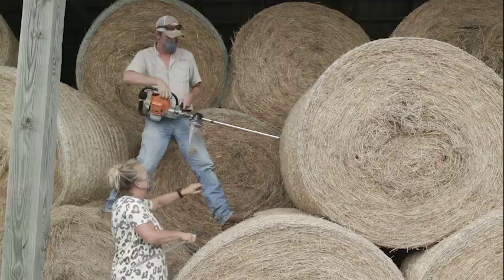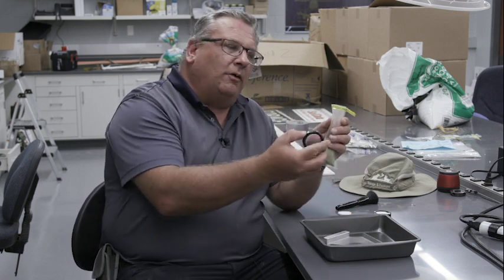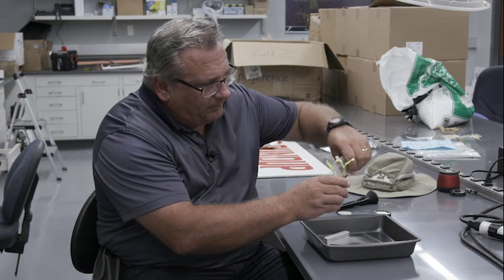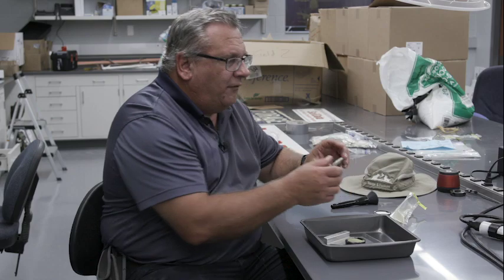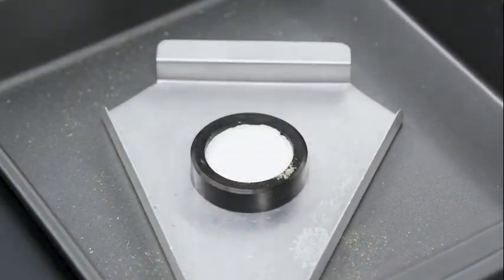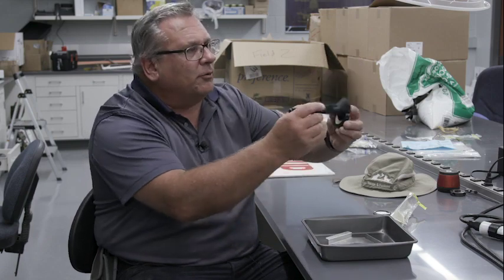So we started with a hay bale, used a hay probe to get a core sample, took that core sample into the lab, weighed it, dried it, and re-weighed it. Then we ground that sample through a two-stage grinding process, ending up with hay essentially in powder form. Now we're ready to analyze this hay for forage quality. We're going to use a technique called near-infrared spectroscopy. We take a cell — we call these ring cups — which has a quartz glass at the bottom, dump the sample into the cell, put a foam back in to hold the forage tight against the glass, and brush off any excess forage dust.